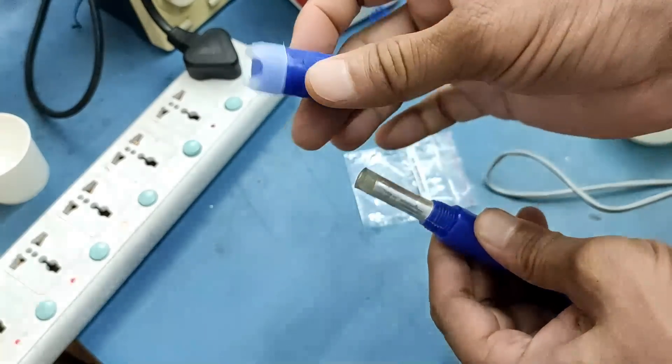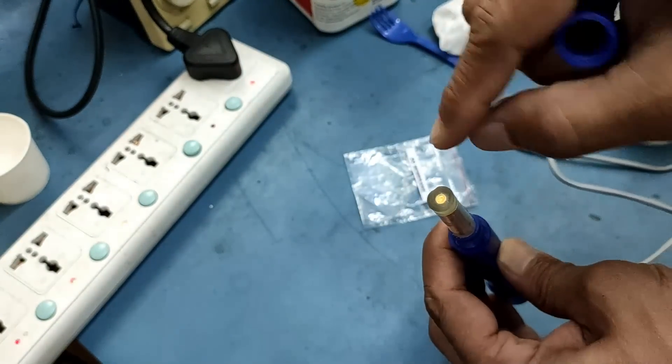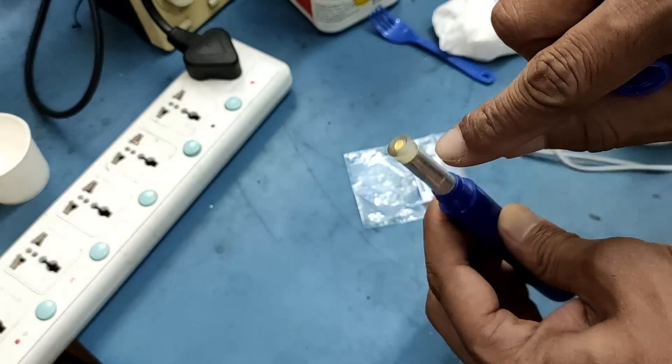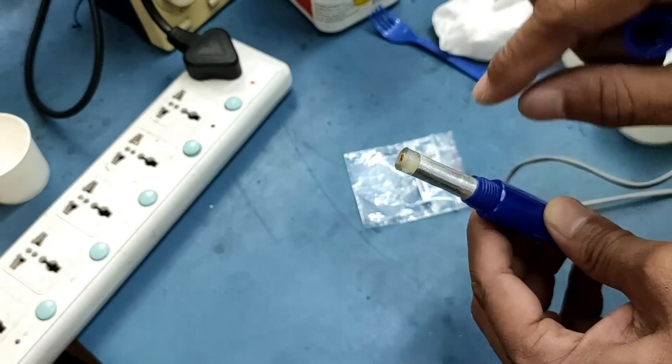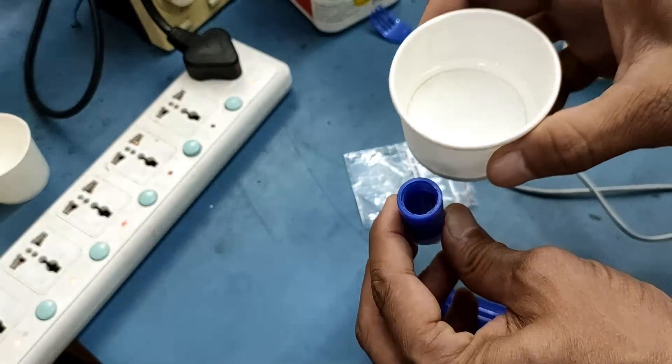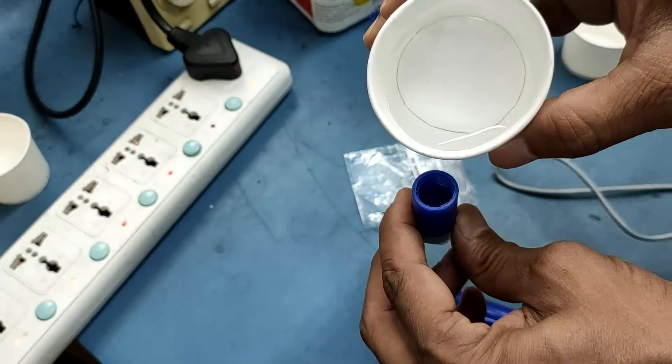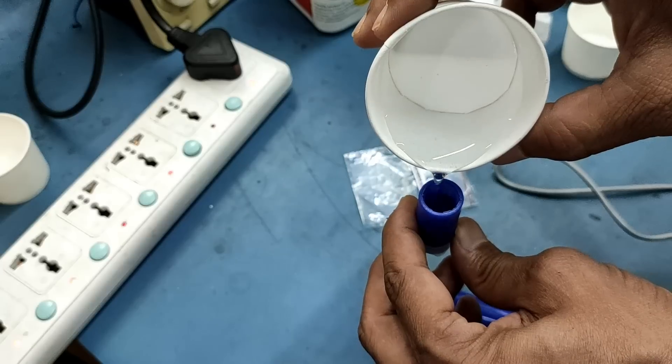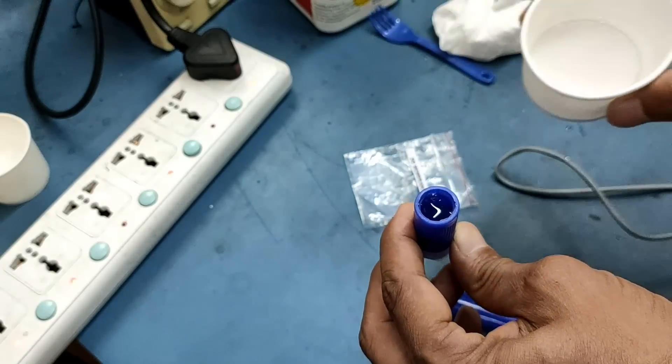Unscrew the membrane cap from the probe and fill about two-thirds volume of the cap with KCL solution. Make sure the probe is in a vertical position with respect to the horizontal plane. Carefully screw the cap back to the probe.